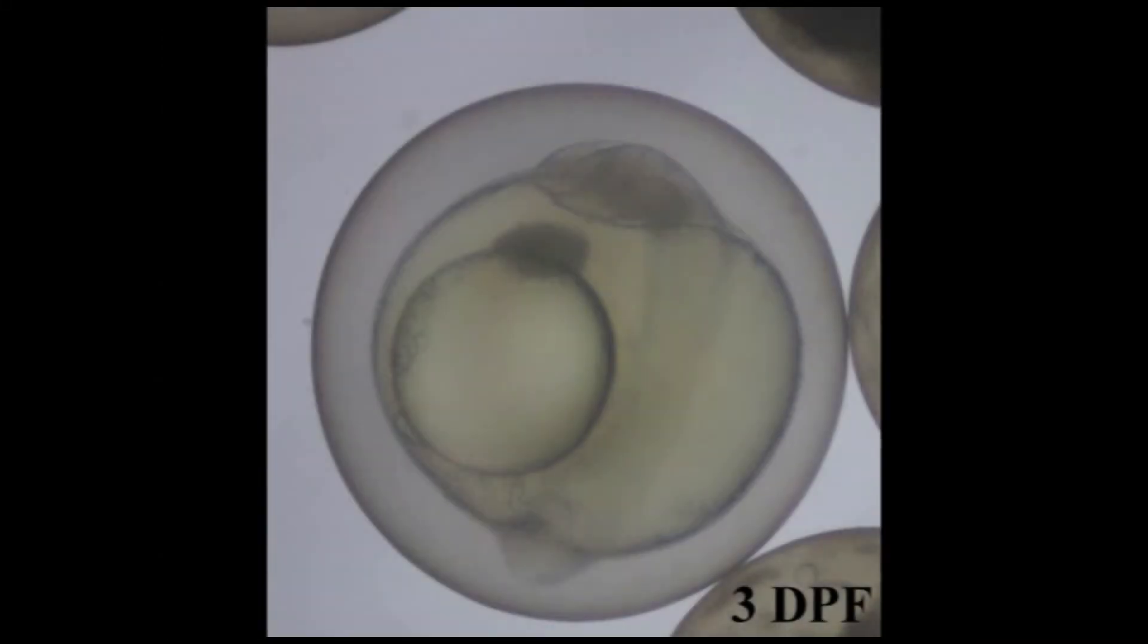At about three to four days post-fertilization, the developing embryo is wrapping around the yolk and oil droplet. The head and eyes become distinguishable, shown at the top of the yolk sac.